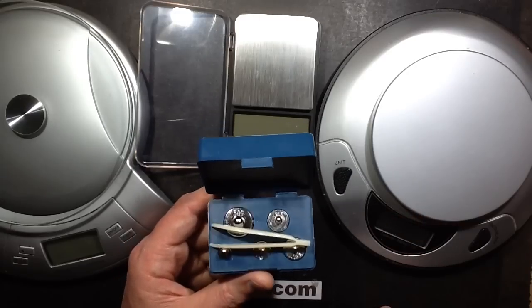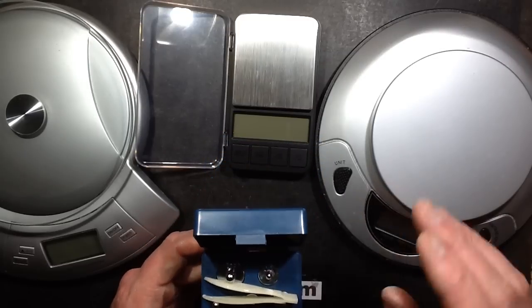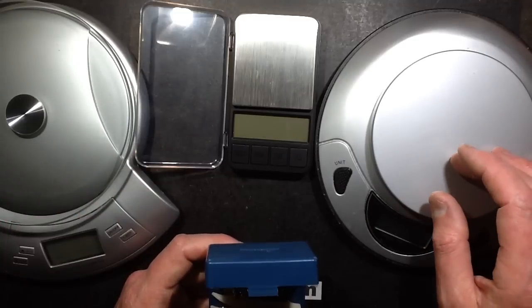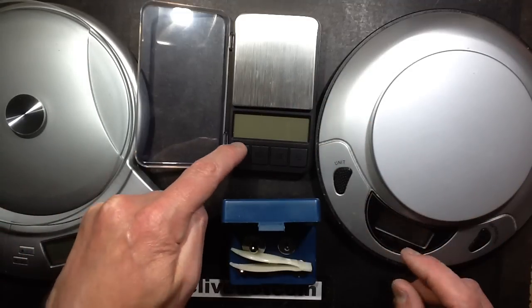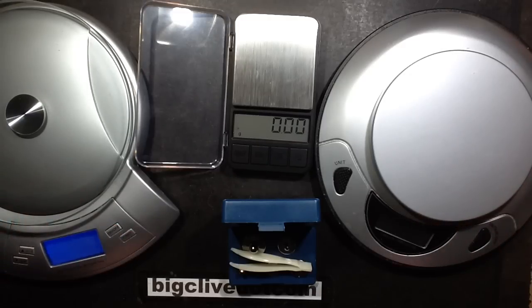I've seen these calibration weights for sale on eBay and I wonder just how accurate they are. The problem is these scales aren't very high resolution — they only go in one gram increments. But this set of scales is a high accuracy one, and you never know how accurate it is in the first place. Without using some sort of industrial calibrated scale, you can't really say — but let's try them out.